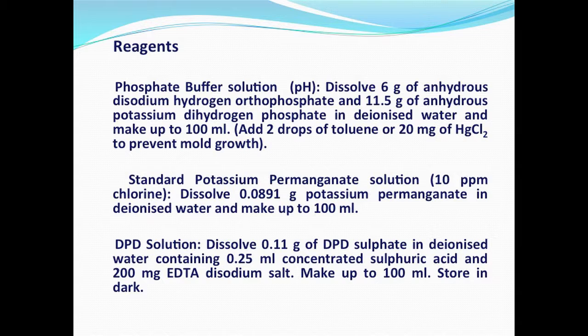Normally people add EDTA separately to complex the interfering elements, but here, as a precaution, I am assuming that you will have water samples from a municipality etc., which will definitely contain other metal ions. Therefore, DPD can be prepared using this EDTA, and in the reaction mixture EDTA will complex with the metal ions and DPD will react with chlorine. Of course, I do not have to tell you that you have to store it in the dark.